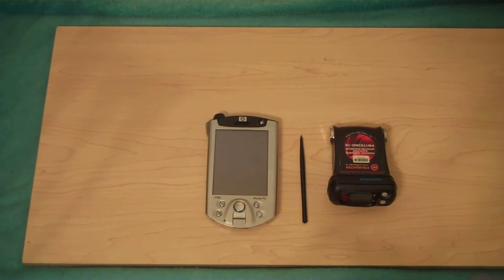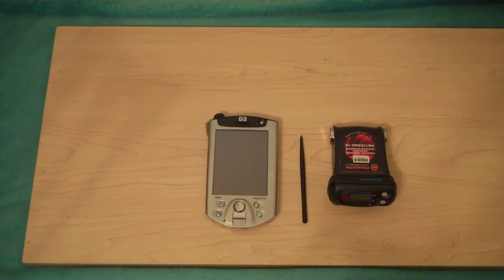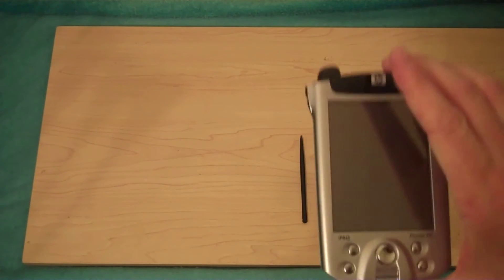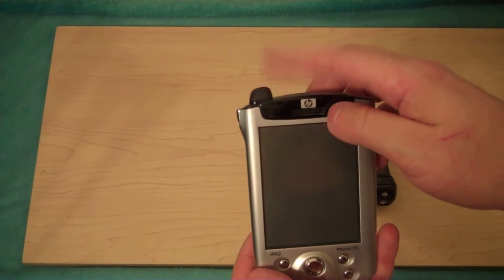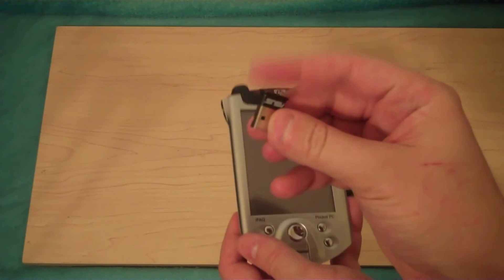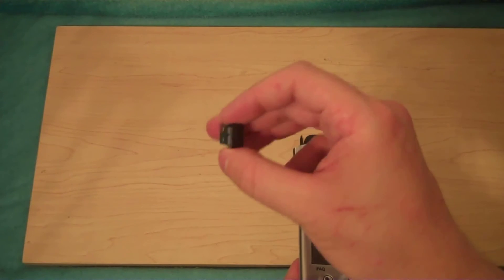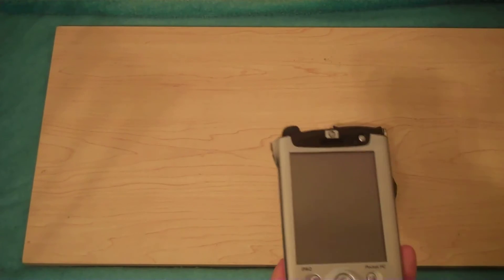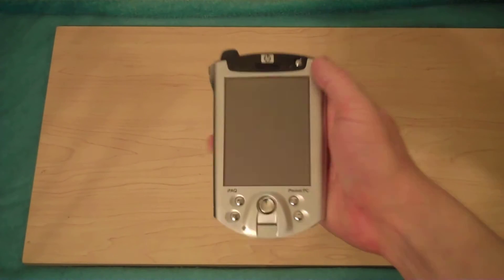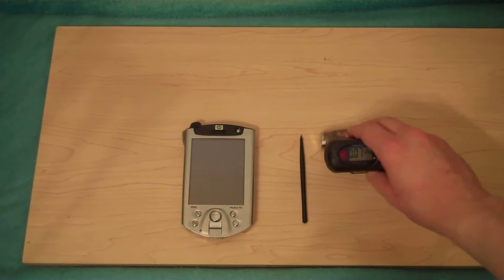This unit is capable of isotope detection and works off of a simple AA battery. It actually gets 1,000 hours of battery life with that battery, or 60 hours if it's connected to a PDA. PDAs can be as little as $50 to $100, or as much as $400 if you buy a nice one, but a $100 one will work great as long as it has Bluetooth.